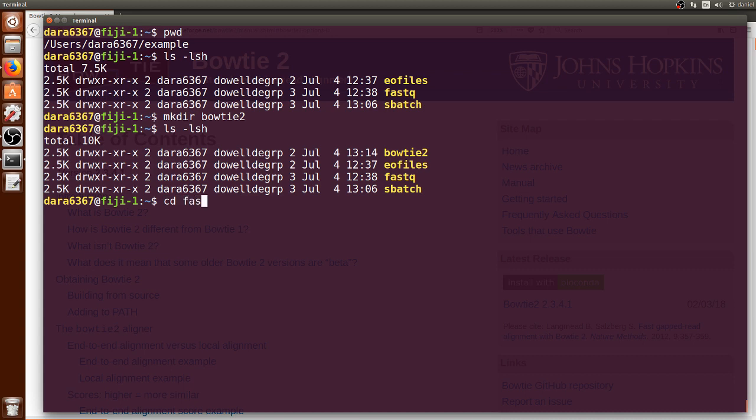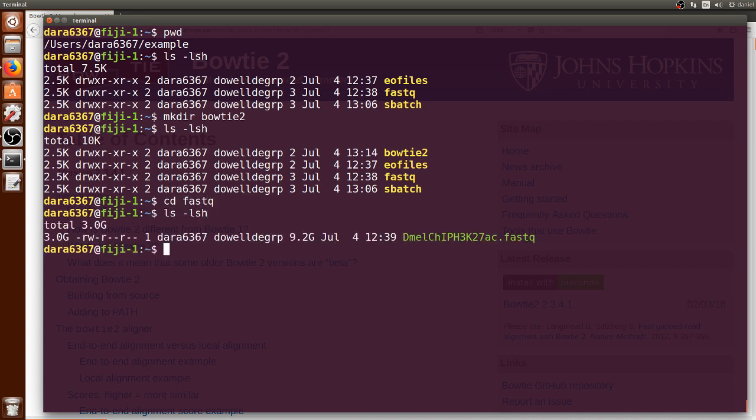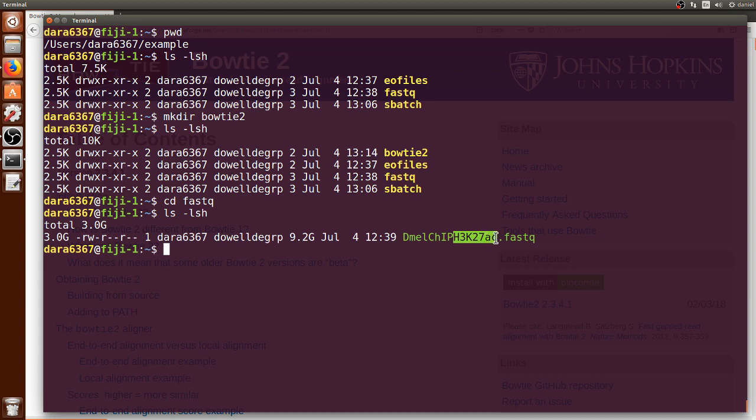We can go now to the fastq folder and there is a single FASTQ file that contains short read sequencing data obtained from an experiment done on the fruit fly Drosophila melanogaster. They did chromatin immunoprecipitation followed by sequencing on a particular histone mark. We can use Bowtie2 to align these short reads to the Drosophila melanogaster reference assembly genome.